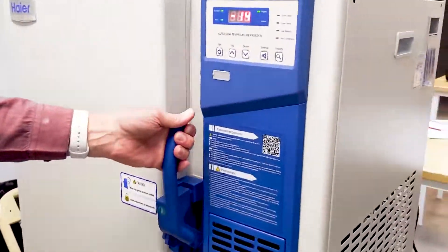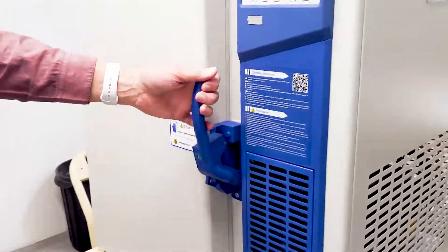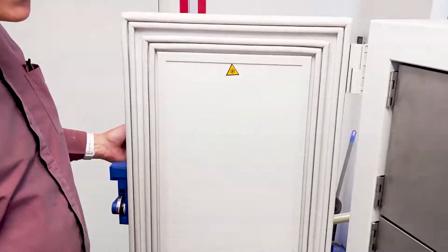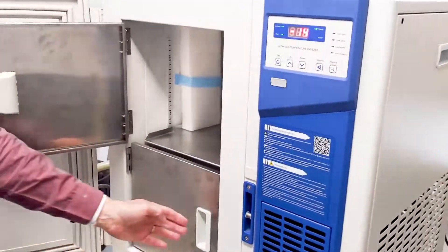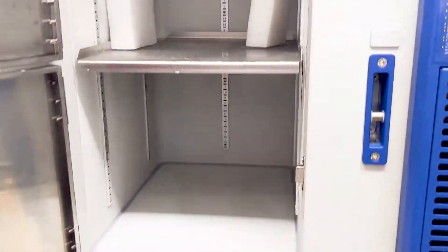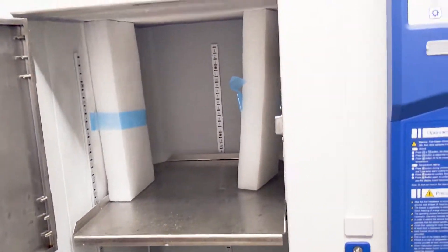There's a double locking door here — a key lock and the facility to place a padlock there if you need it. A nice firm locking mechanism on that, with multiple seals on the doors. There are two inner doors and a 100 litre capacity. It comes supplied with one shelf, but there is the possibility to move the shelves up and down through a range of positions.